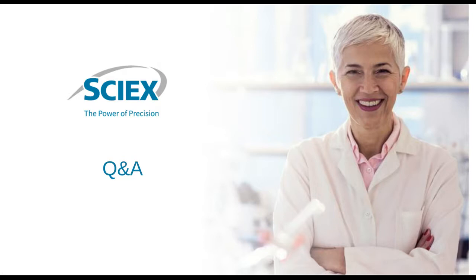Thank you. Next question. How quickly can you generate a peptide map for a typical antibody sample? And what concentration of sample is needed for a peptide map? Well, it depends on if you're wanting high resolution or high speed. Typically with ZipChip, the high resolution chips take about 10 to 15 minutes. We start with a concentration of 1 milligram per mil, but we can also go lower than that. But the high speed chips are around 7 minutes.